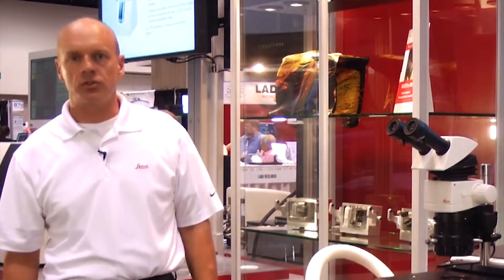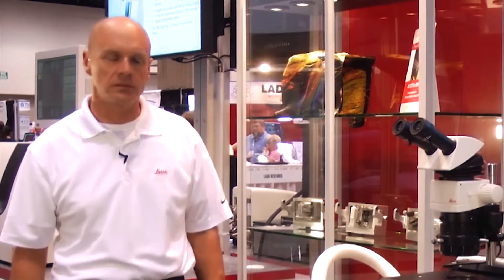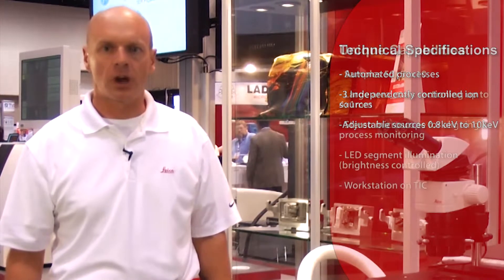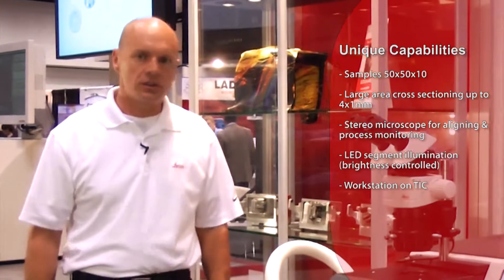Today I'd like to introduce our TIC3X ion beam milling system. This is a milling system that uses an argon beam to abrade samples that are prepared for scanning electron microscopy. The process is computer controlled with an easy touchscreen operation and automated so that the sample can be milled on overnight processing.